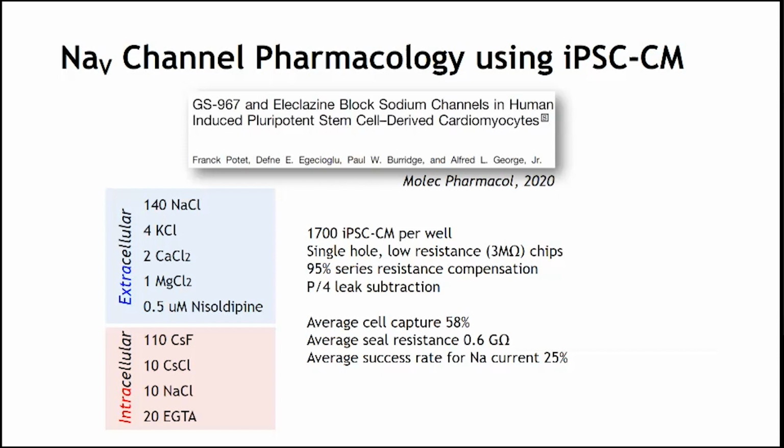Here is simply describing for you some of the details of that study as it relates to the automated patch clamp. Here are the two internal and external solutions. I want to thank Elena for going over in detail the technology. I won't repeat that. For this study, we wanted to focus on sodium channels. So we used an extracellular calcium channel blocker, nisoldipine, and a cesium-based internal solution to prevent potassium conductances. And here are sort of the metrics of how this study was done.